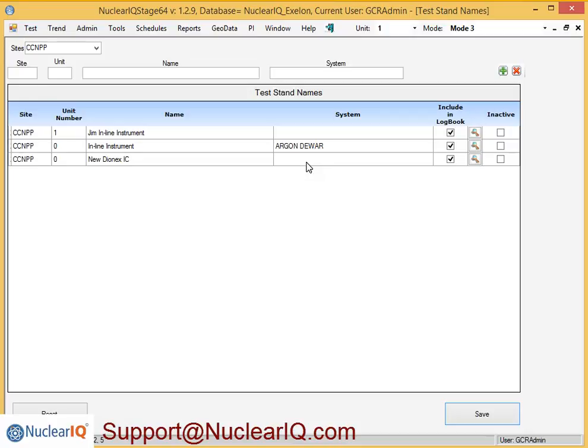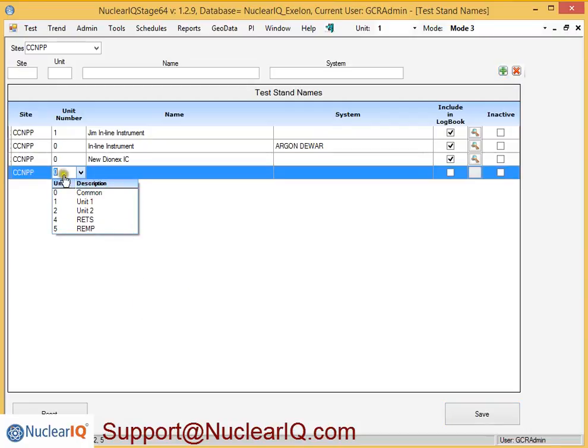And that's for a different series of videos. But for this, let's add a new system. So let's say we had an ion chromatograph, an ICS 2100, and it's an anion calibration curve.